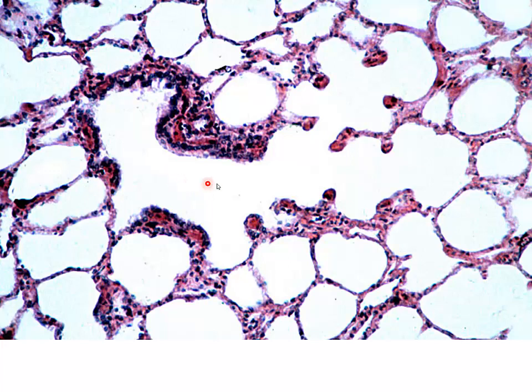Now, as we move from respiratory bronchiole, then we move into an alveolar duct. And remember, this is simply defined as a common elongated pathway that's defined by alveoli. And these alveoli that line the alveolar duct are going to have these rings of smooth muscle. And in cross-section, they just look like little knobs of smooth muscle. And so here we have an alveolar duct, and here we have an alveolar duct. And then all of the other tissue that we see here in this field are going to be actually alveoli.